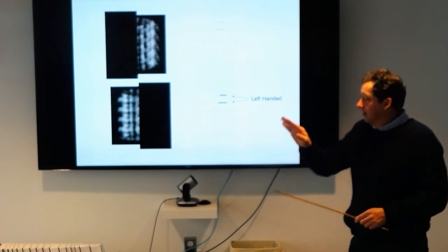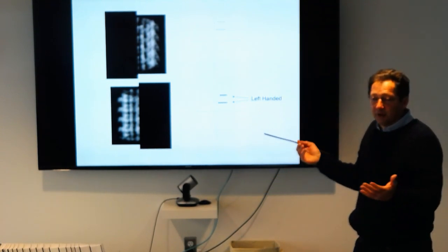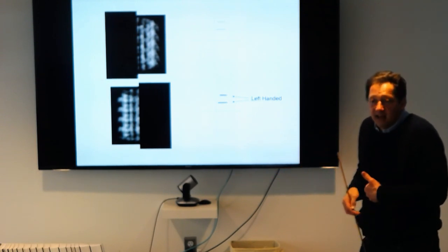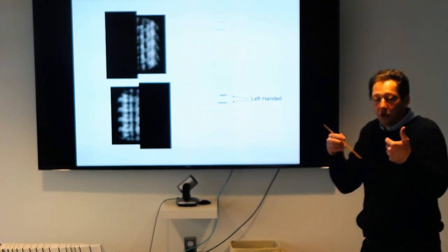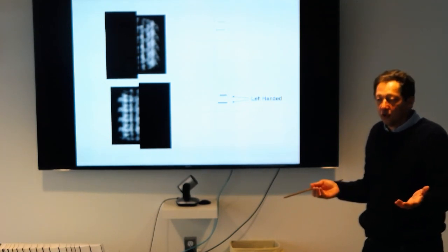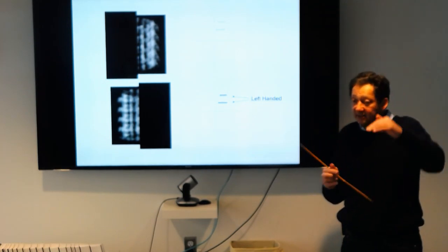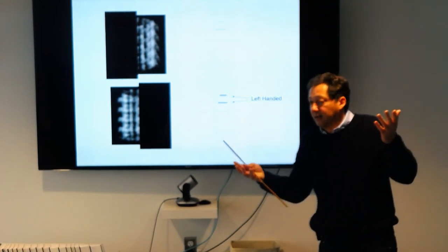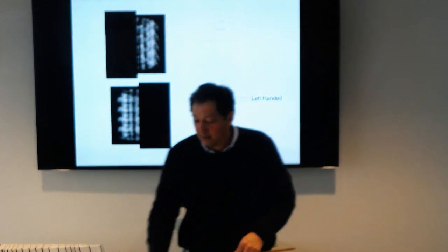Because it's like a system of equations. I mean, not exactly, but I myself wrote a Python script to go through several possible selection rules that satisfy this number for these two layer lines, and that gave me the selection rule.